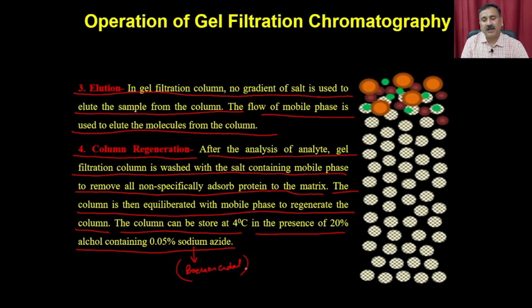So we have prepared a very small demo clip. In this demo clip, we are going to explain how you can pack the column, how you can test the quality, and then how you can resolve the proteins and determine the KD values. In this demo, the students have shown you all these operations of gel filtration chromatography.